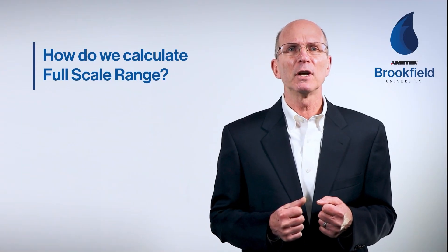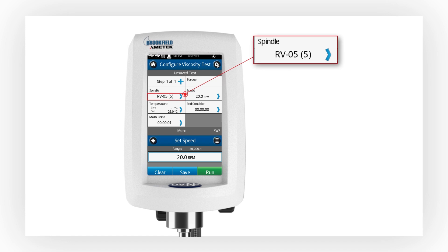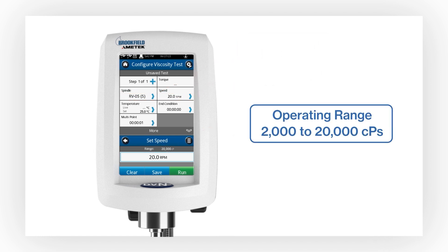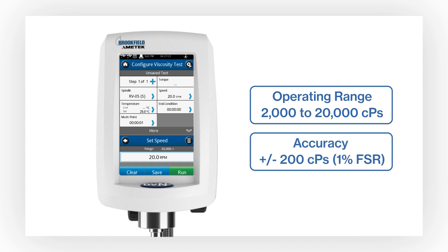So how do we calculate the full-scale range based on the spring, spindle, and speed? In this example, we see an RV spring, RV5 spindle, and a speed of 20 rpm. The full-scale range is displayed in the gray information bar on the set speed window. It shows an FSR of 20,000 CPS, or 100% torque. The operating range is therefore 2,000 to 20,000 centipoise, and accuracy is plus or minus 200 centipoise, or 1% of the full-scale range.